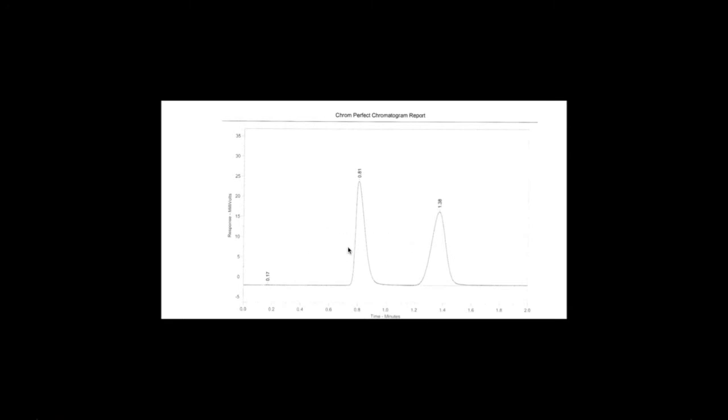Now, the reason for this is the inherent difference between simple distillation and fractional distillation. At your first run, when you do your simple distillation with 1 theoretical plate, this is basically the constituents of your mixture. Even though there's a higher percentage of cyclohexane in there, there's still a good portion of toluene in it as well. Now, to get this to a more pure sample, the simple distillation will have to be run over and over and over again, and then this graph would match very similar to graph 1 from our fractional distillation.